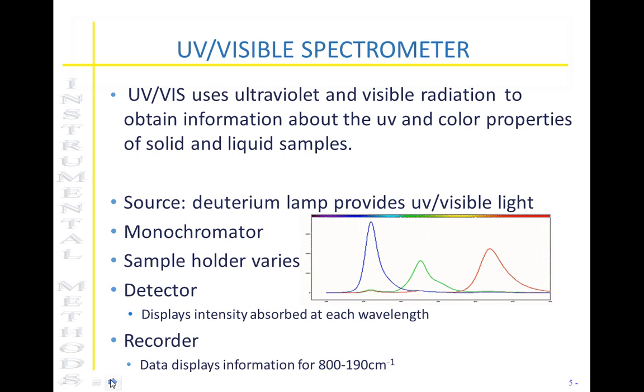Your sample holders can vary depending on if it's a liquid or a solid sample, but the detector is going to always display the intensity absorbed at each wavelength. So you will get data very similar to what is shown on this slide.